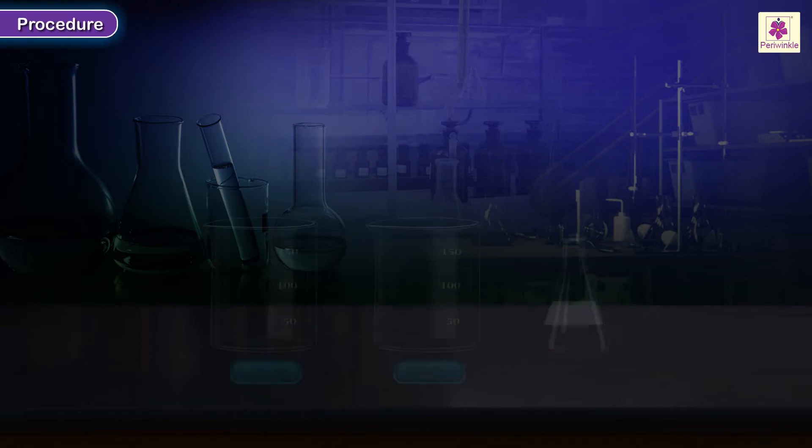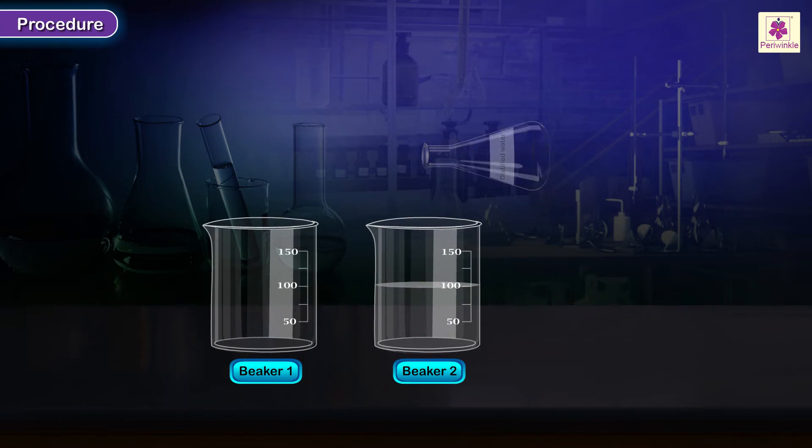Procedure: Take 100 ml of distilled water in each of the two 150 ml beakers.